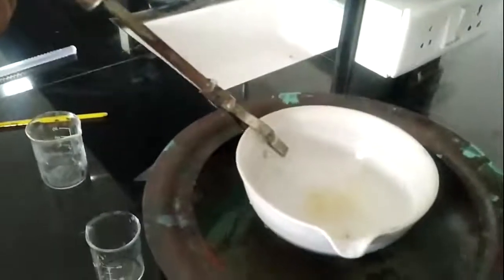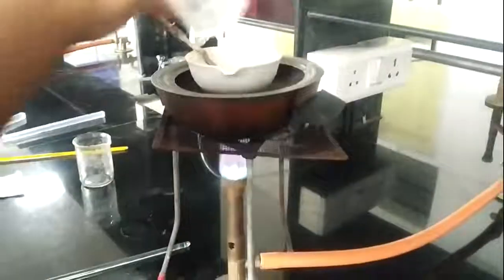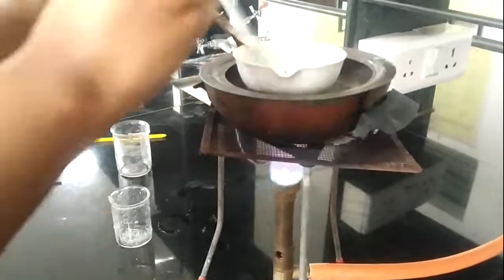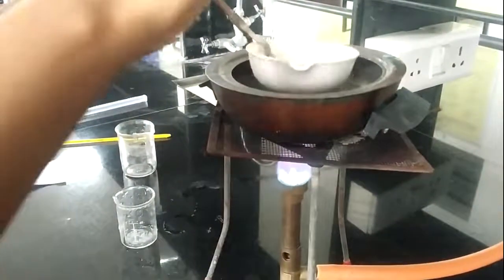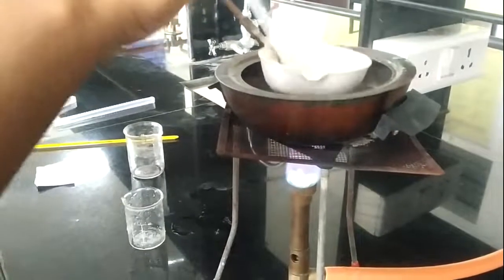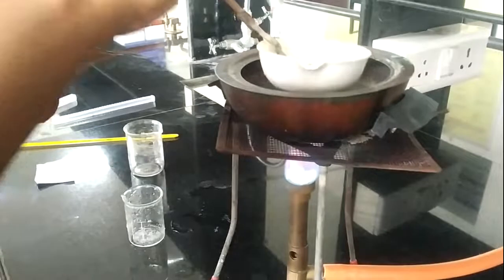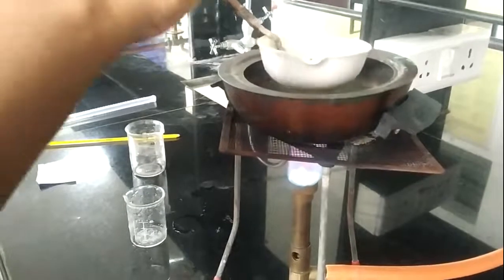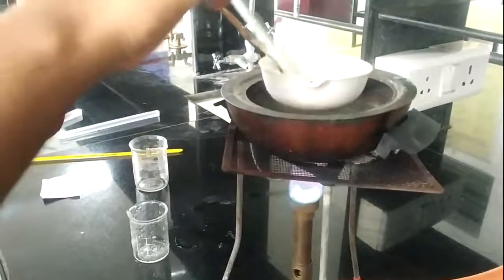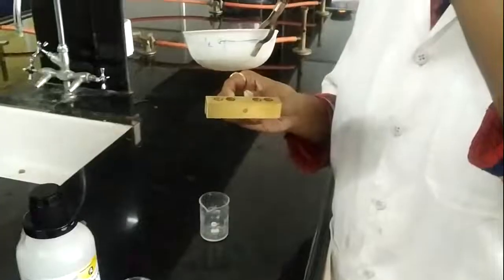Now I am going to transfer this chloral hydrate into it and mix it properly. After proper mixing of the melted cocoa butter and chloral hydrate, now I am going to pour this mixture into the previously lubricated mold.